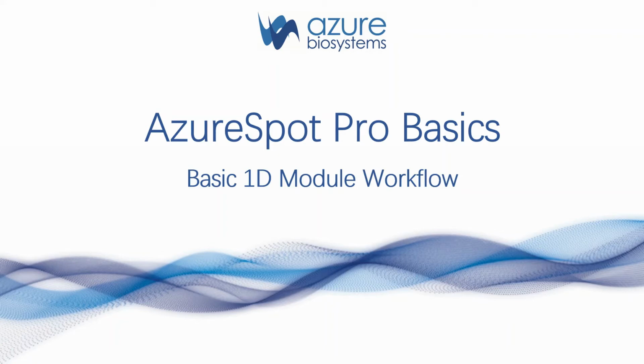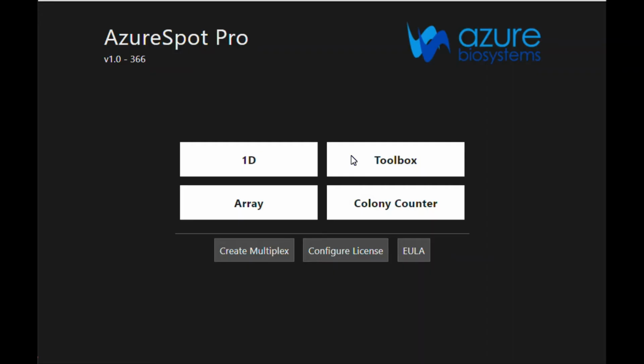Hi, this is Azure Biosystems, and today we are going to cover the basic 1D module workflow in the AzureSpot Pro analysis software from Azure Biosystems. AzureSpot Pro analysis software offers modules for 1D analysis, array analysis, a colony counter, as well as a toolbox analysis module. Today we are going to cover basic analysis using the 1D module.